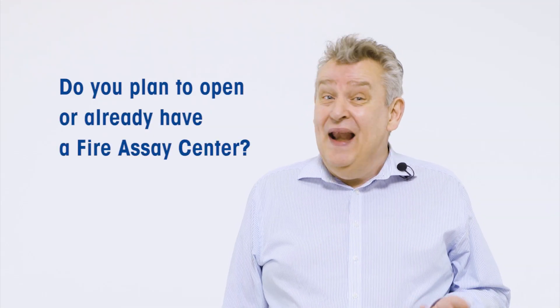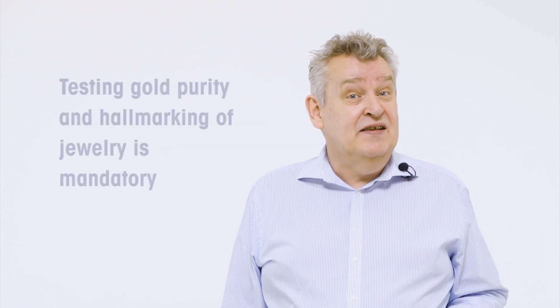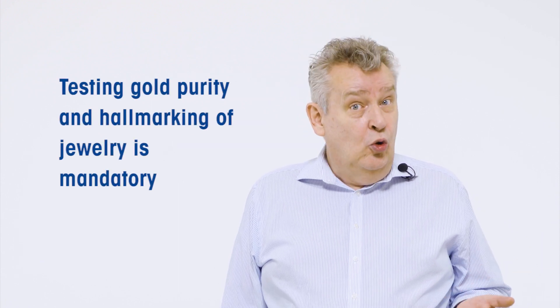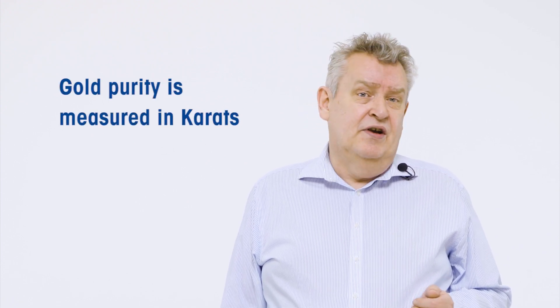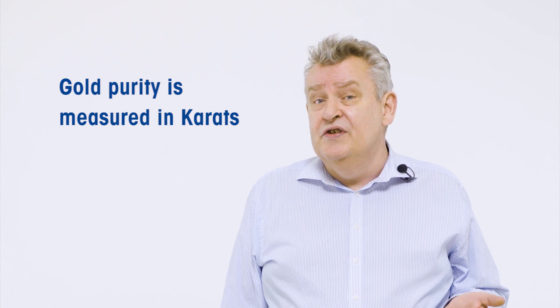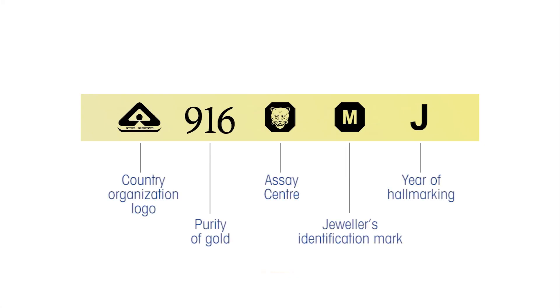If you have or you're planning to open a fire assay centre, you already know that testing gold purity and hallmarking of jewellery has become mandatory to ensure consumer protection against malpractice. Gold purity is measured in carats — for example, 916 indicates 22 carat and denotes the purity of gold in the final product. The hallmark stamp authenticates that the metal used conforms to national and international standards for gold fineness.